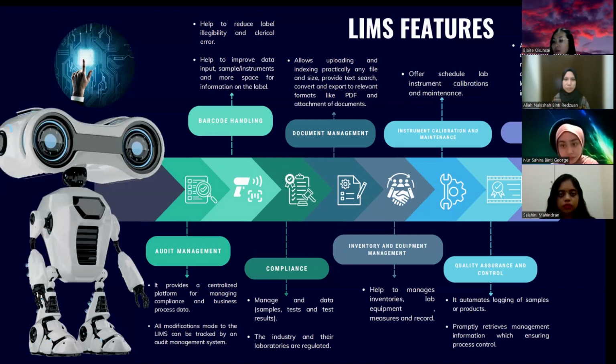The sixth one is instrument calibration maintenance, where it offers the ability to schedule the lab instrument calibrations and maintenance for each of the instruments provided in the laboratories. And the seventh one is quality assurance and control.